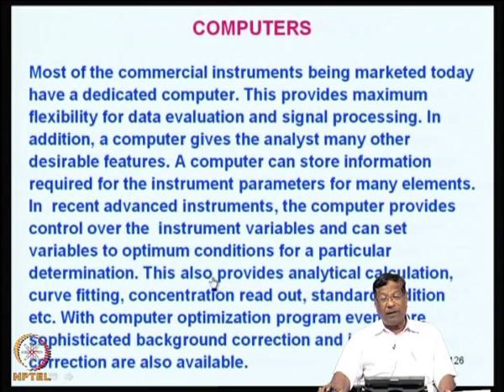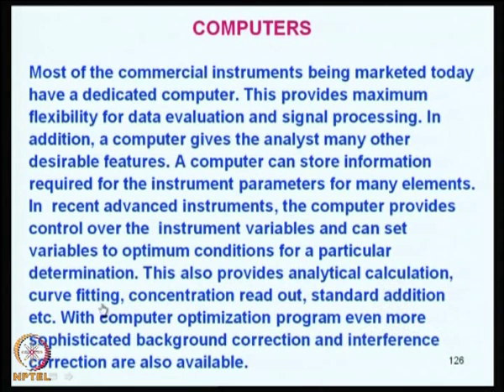This also provides other types of analytical calculation, curve fitting, concentration readout, standard addition, etc. And with a computer optimization program, even more sophisticated things like background correction, this is very important, and interference corrections are also possible.